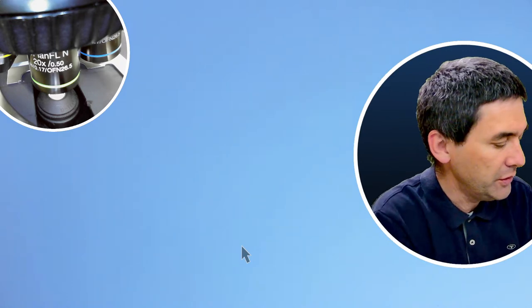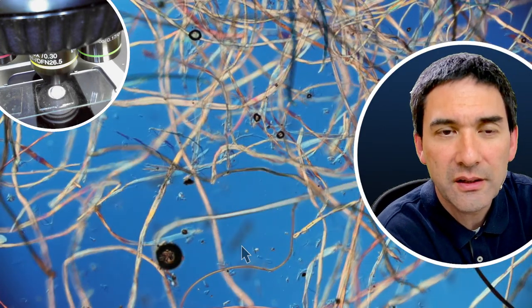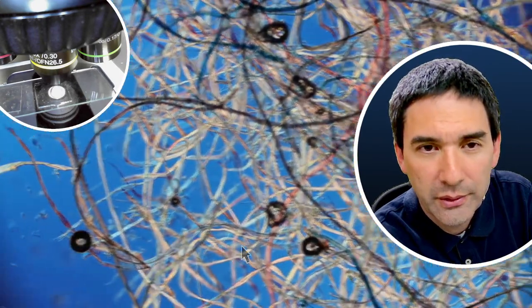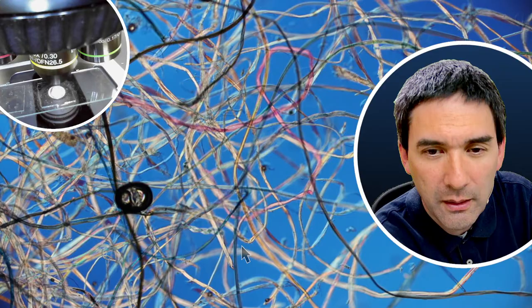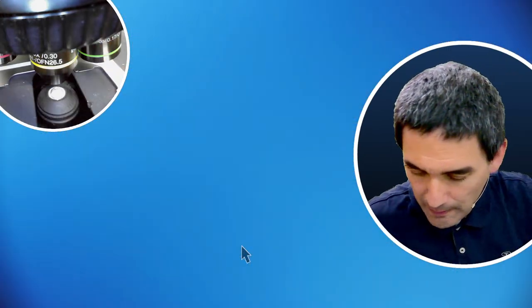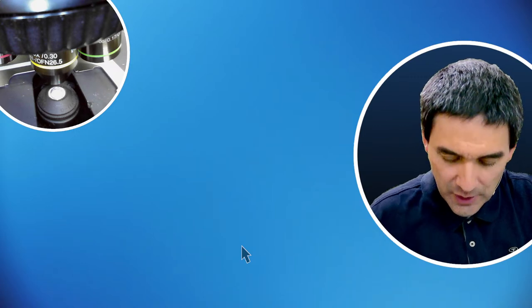So what is this one over here? This is also a sample which I made recently. Oh, okay. That's dust. That is the dust slide I remember I made some time ago. These are dust fibers, textile fibers, also in PVA glue. Okay, so I think it's one of my new favorite mounting media now, because it's water-based and therefore quite easy to use. What else do I have here? What is this here? I don't know what this is. Let me check this.